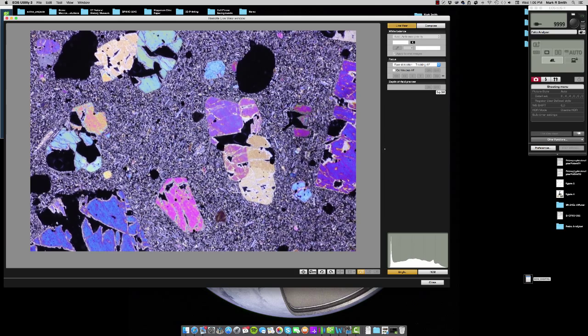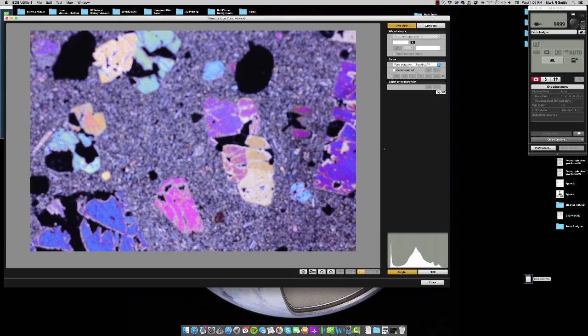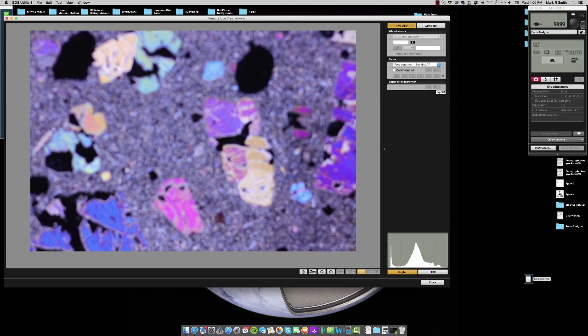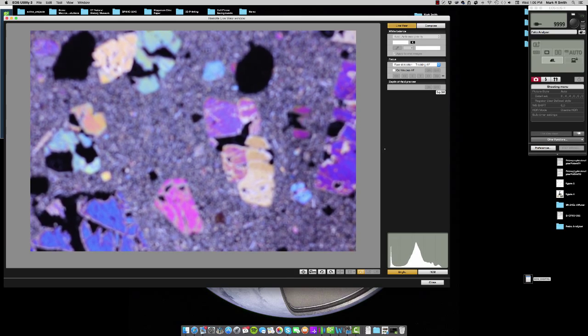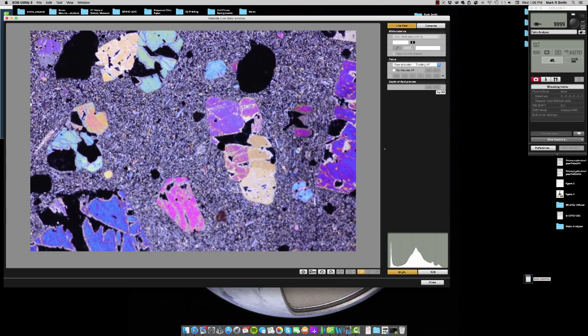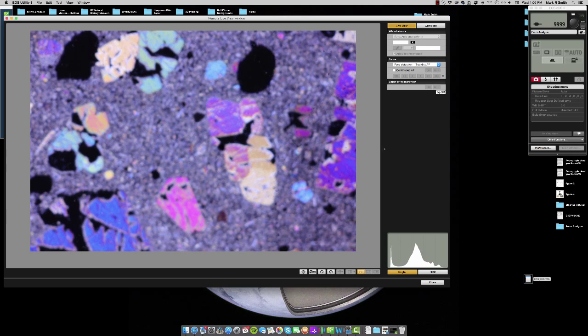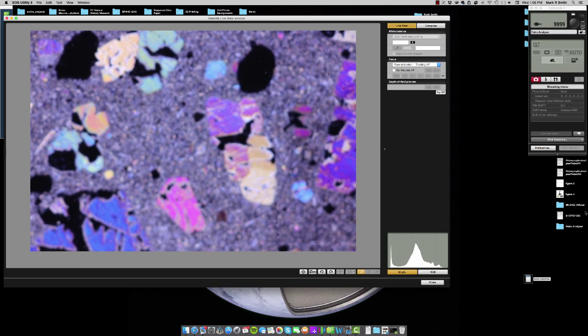So you can see here that this is the live view. What I'll do is I'll pull the sample all the way forward so that I'm focused on the back of the sample and then I'll push it so that I'm focused on the front of the sample.